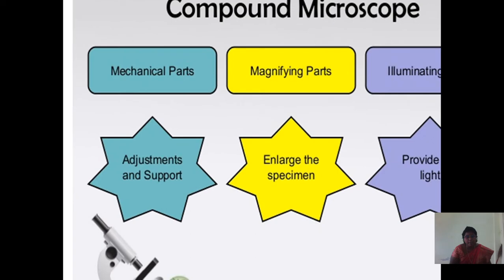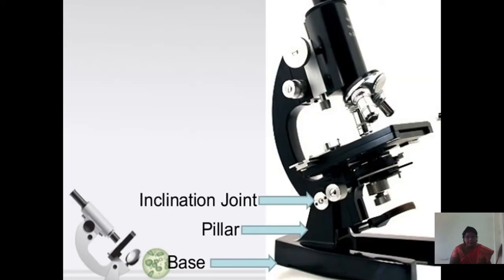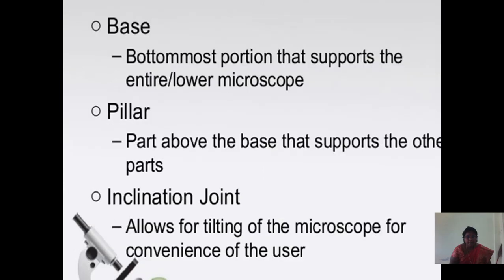A compound microscope has mechanical parts, magnifying parts, and illuminating parts. Mechanical parts provide adjustments and support; magnifying parts enlarge the specimen; illuminating parts provide the light. The mechanical parts include the inclination joint, pillar, and base. The base is the bottommost portion that supports the entire microscope. The pillar is the part above the base that supports the other parts. The inclination joint allows for tilting of the microscope for convenience of the user.